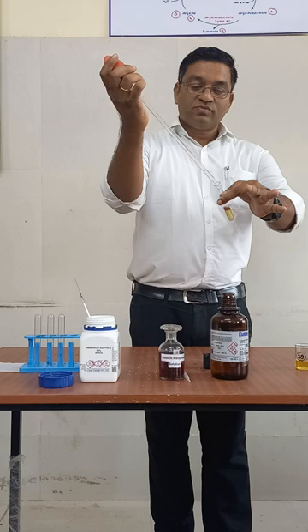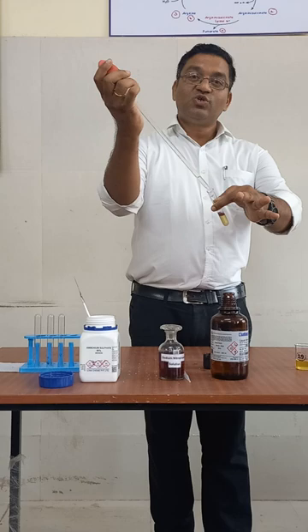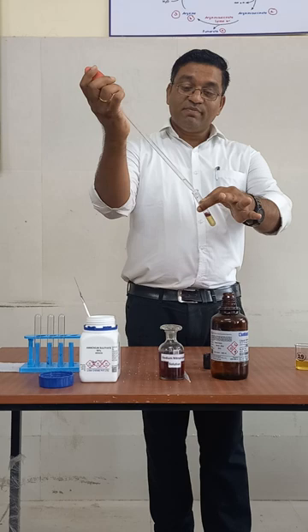This addition should be very slow. Acetone and acetoacetate give this test positive, while beta-hydroxybutyrate, being a false ketone body, does not give this test positive.